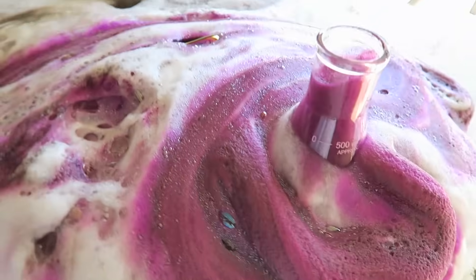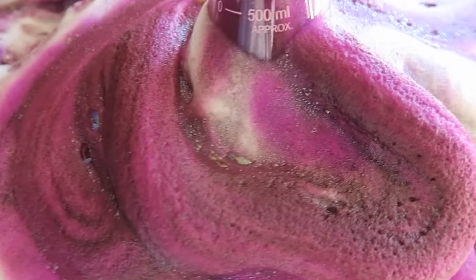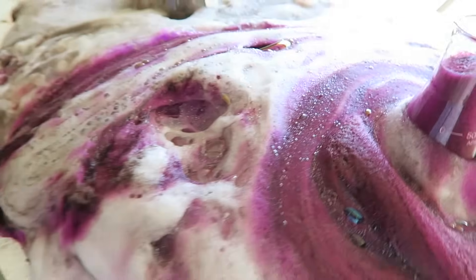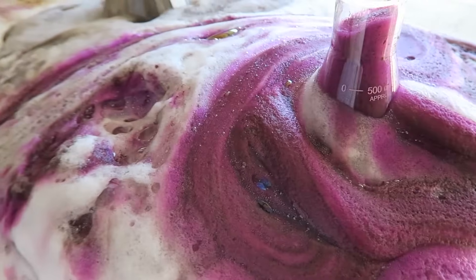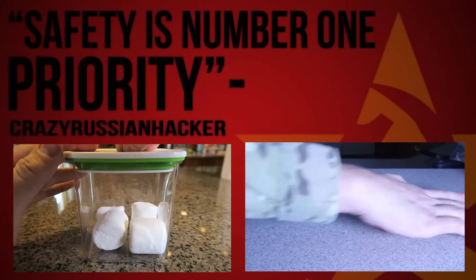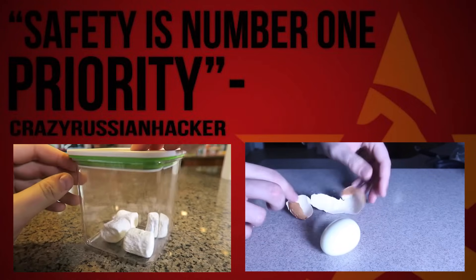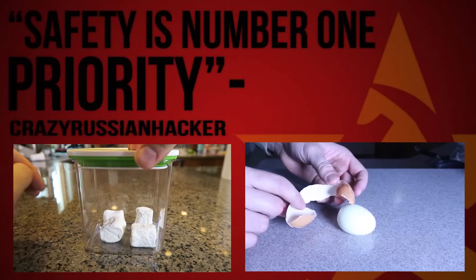Look at these colors, this is amazing, don't you think? And it's still sizzling. Love this experiment. Please thumbs up this video — smash it like that. And guess what? All the oxygen! Look at this, this is awesome, all in one shot.